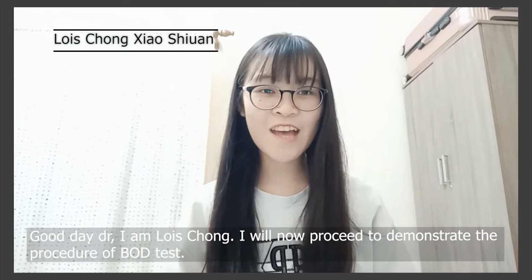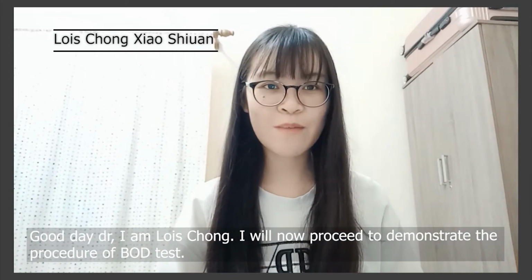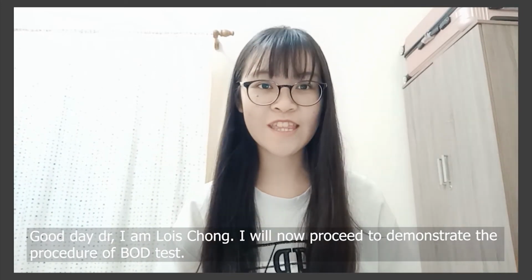Good day, Doctor. I'm Lois Chong. I will now proceed to demonstrate the procedure of the BOD test.